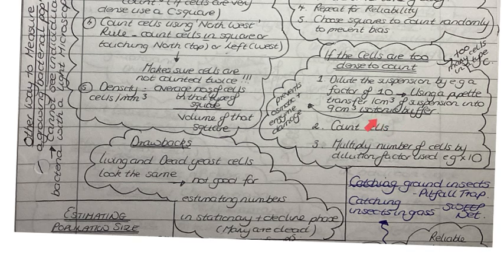And then you would add 9 cubic centimetres of an isotonic buffer to that boiling tube. It needs to be isotonic so that the cells don't take in water by osmosis and burst, and it needs to be buffered so that there is no enzyme damage.